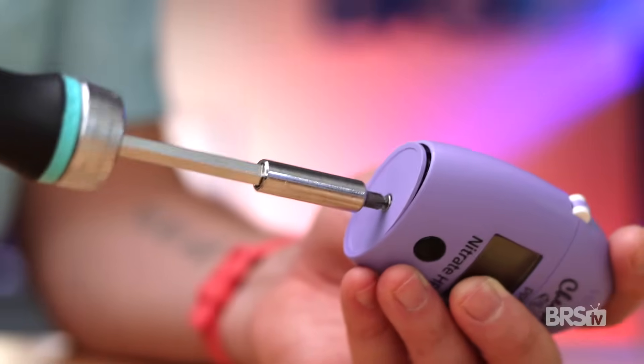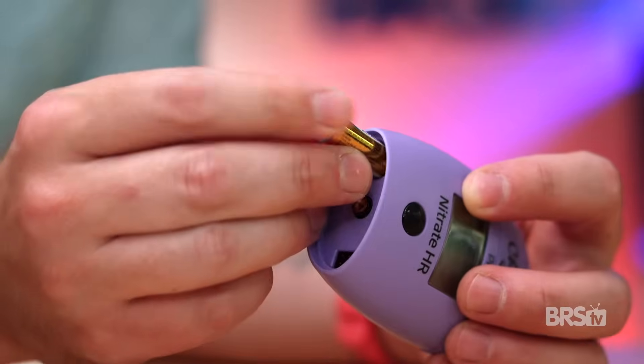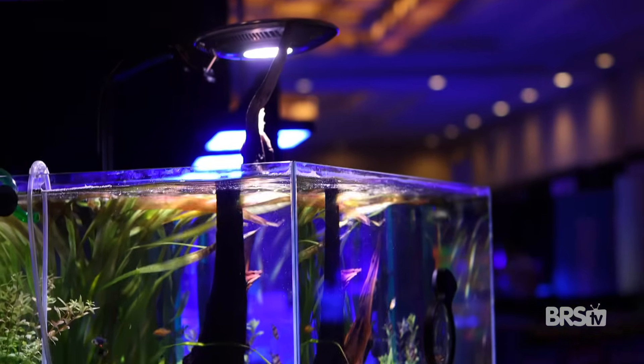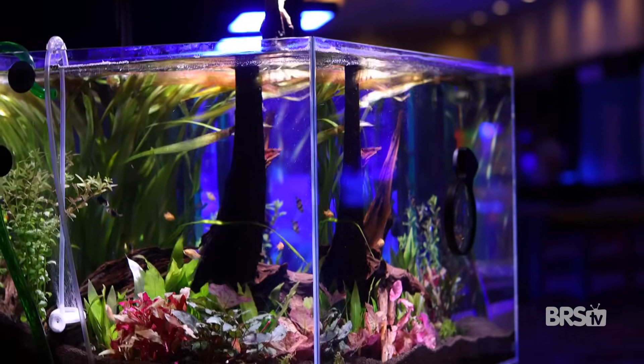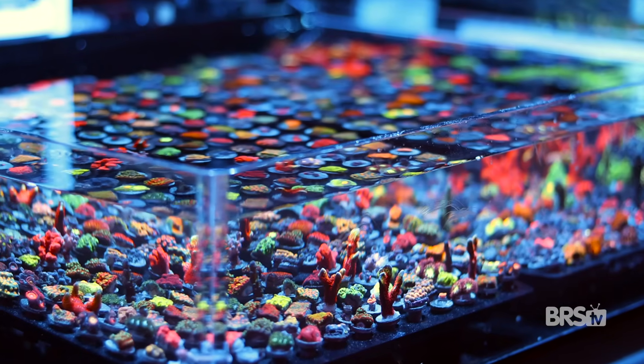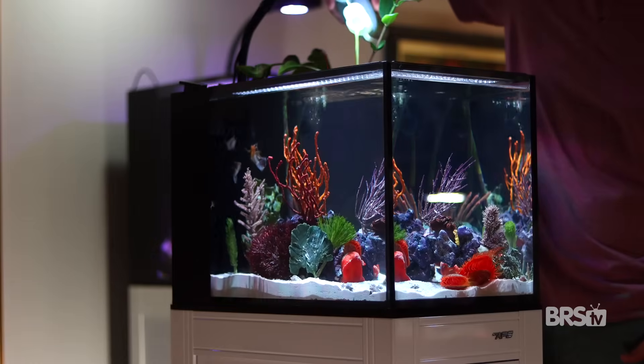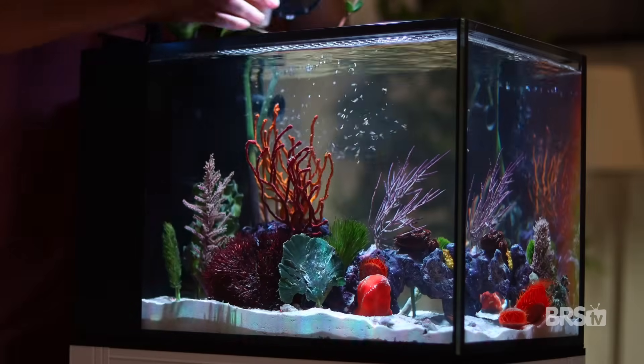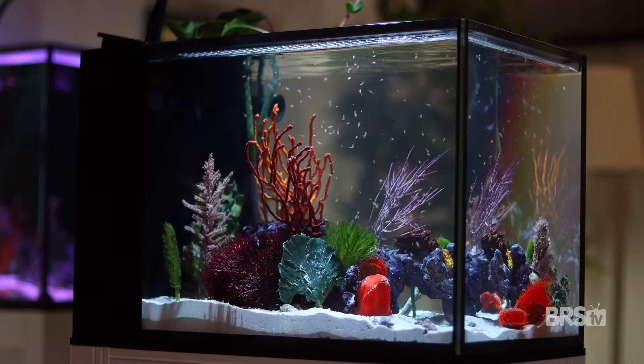To get the nitrate checker up and running, you'll use a Phillips head screwdriver to remove the base plate, install the battery, and reinstall the base plate. I primarily use the nitrate checker to diagnose problems with my tank, really regarding filtration. If my nitrate readings are a bit low or undetectable, that means I can feed more and reduce my mechanical filtration. And if the opposite is true and my nitrates start to creep up, that usually means I can feed less, feed a different type of food, or increase my mechanical filtration.